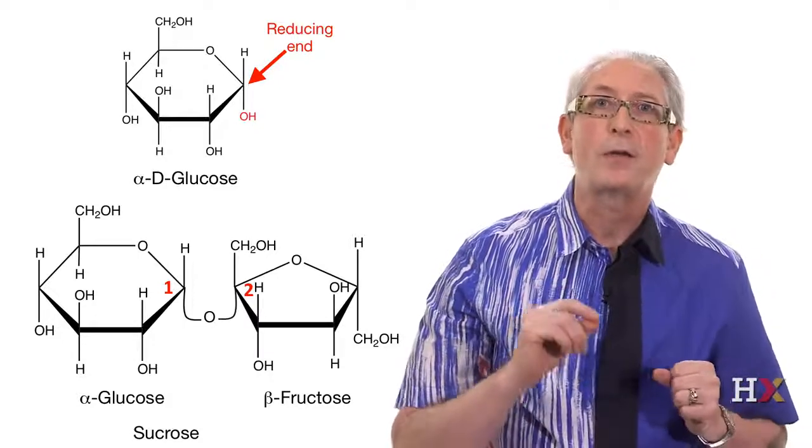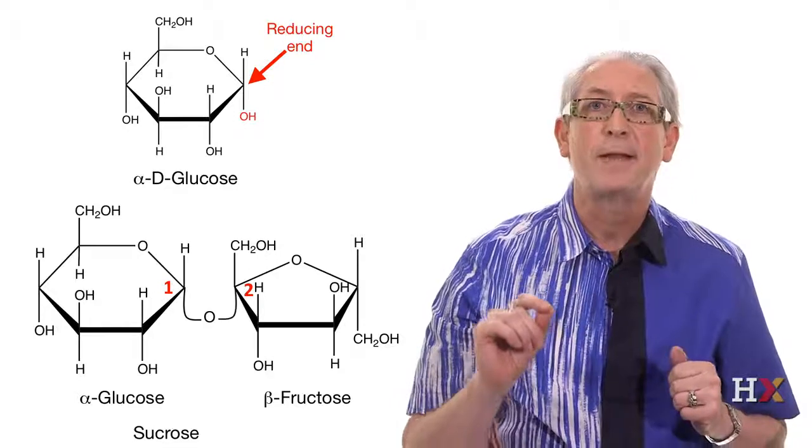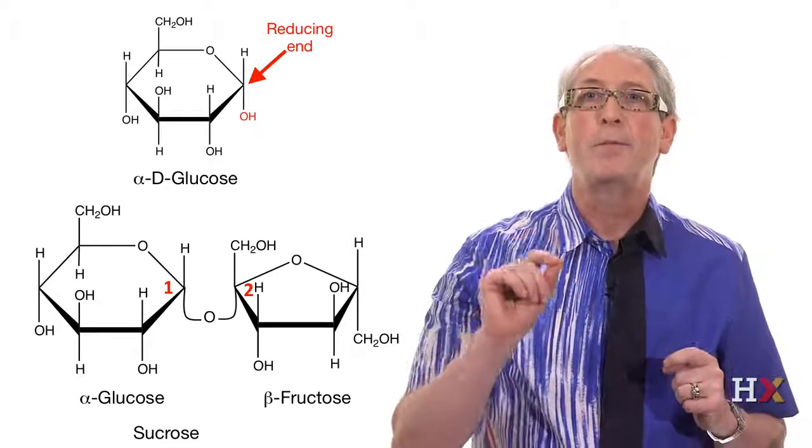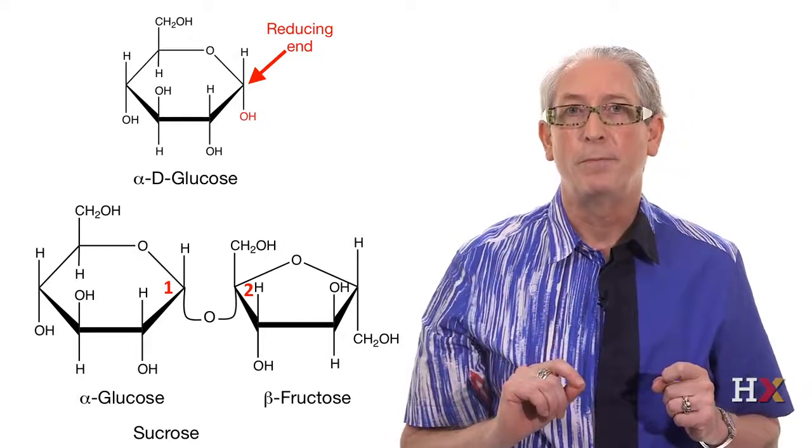So this is in fact a control reaction suggesting that a reducing end is needed for the bleaching of methylene blue. A better experiment would be the comparison between maltose, a reducing disaccharide, and trehalose, a non-reducing disaccharide, because both disaccharides are made of 2 glucose units.